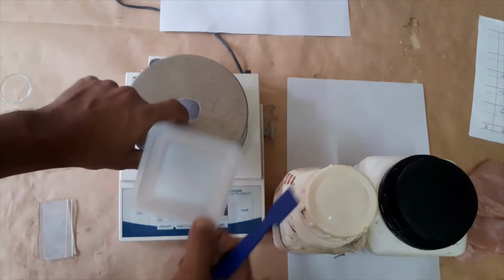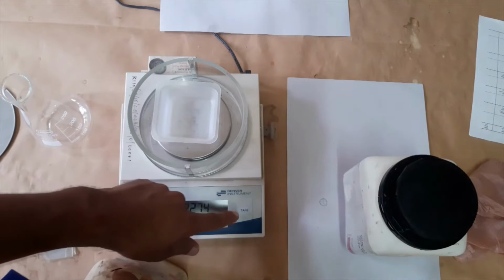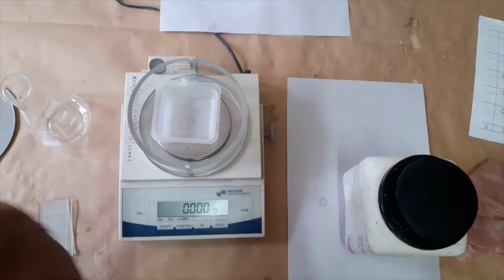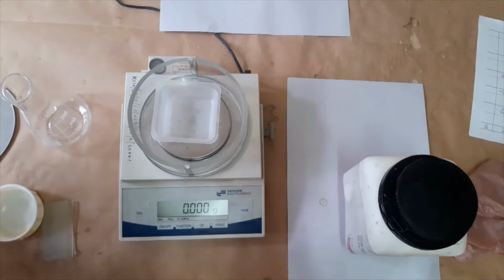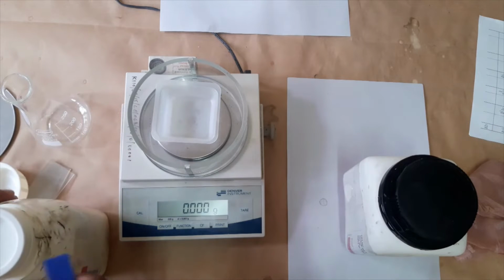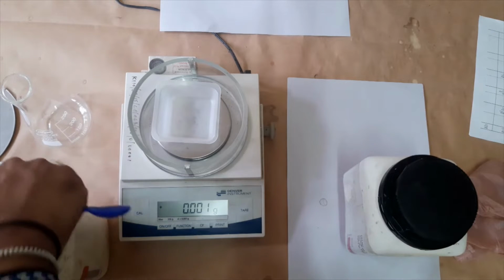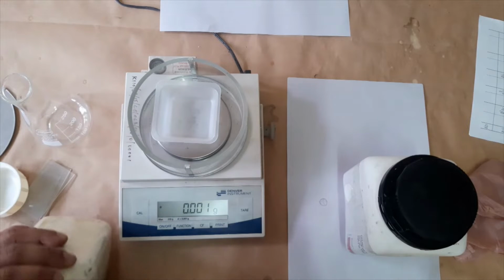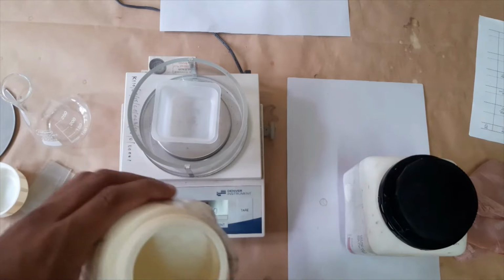Okay, now we can add our weighing pad, and I will measure 20 milliliters and 20 grams of our silica gel per each. In this situation we have to wear a mask properly, and we will use our safety goggles also, because silica gel is a powder, it is cancer causing. Because of that we have to use a face mask. Yeah, you can see it's a powder-like thing.